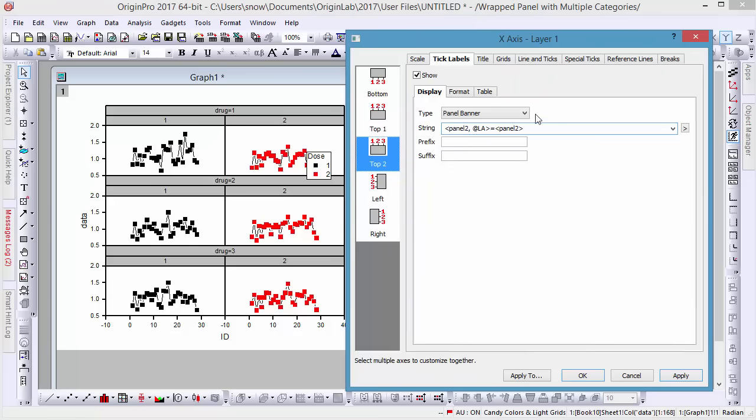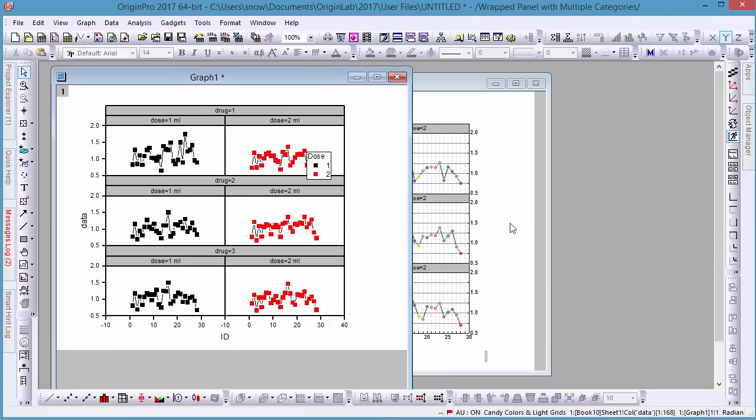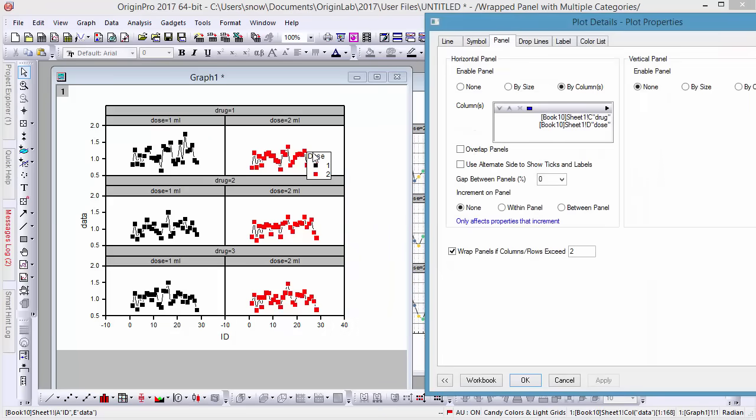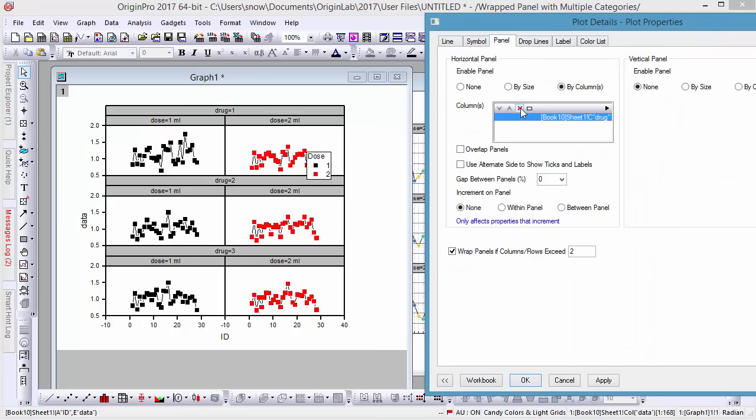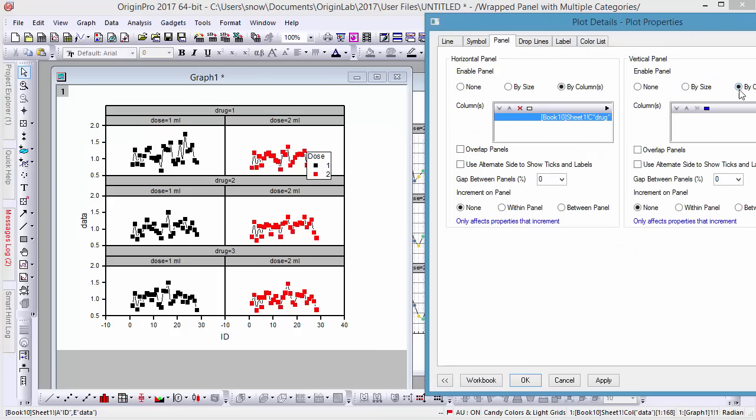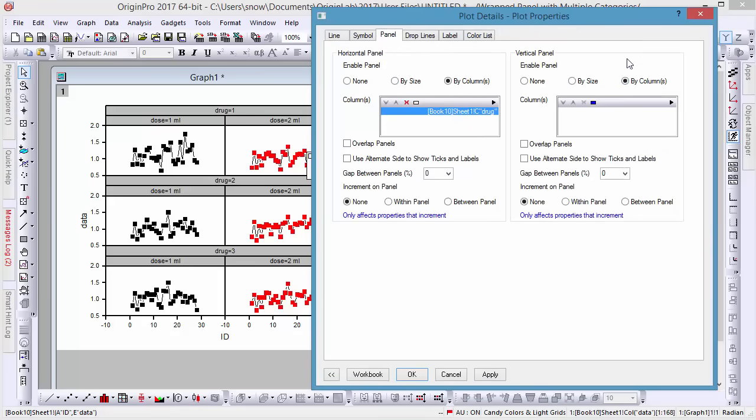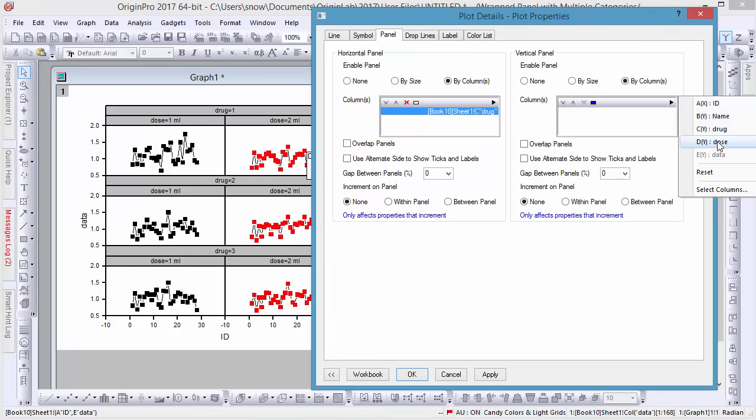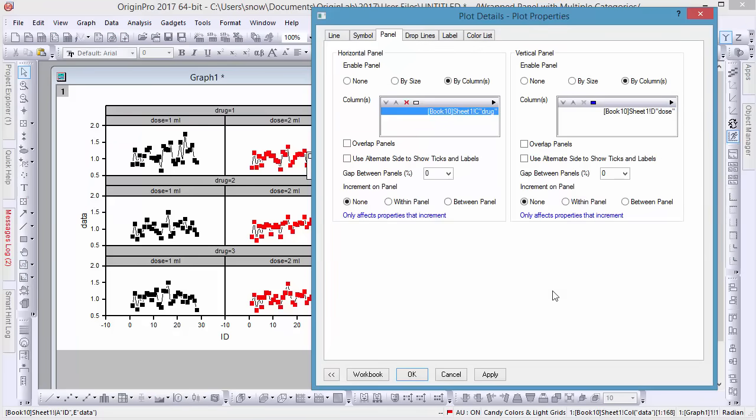Should you decide to remove one of the panel variables altogether, you can always go back to the Panel tab in the Plot Details dialog and add or remove the column variables from there. In this example, we'll remove the Dose column from the Horizontal panel and add it to the Vertical panel, making the graph show 2x3 panels.